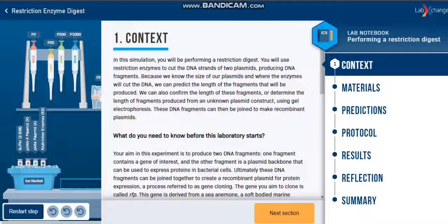Restriction digestion is the process of cutting DNA molecules into smaller pieces with a special enzyme called a restriction endonuclease, sometimes just called restriction enzymes or RE. A special enzyme recognizes specific sequences in the DNA molecule, for example GATATC, wherever the sequence occurs in the DNA.